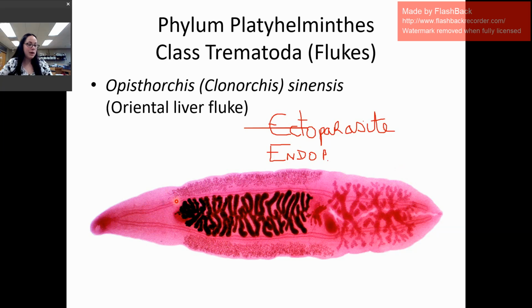If you look at the manual, you have a representation of that on figure 37.5. And so I'm going to describe this slide. So this is here the anterior part of the body. How do I know?